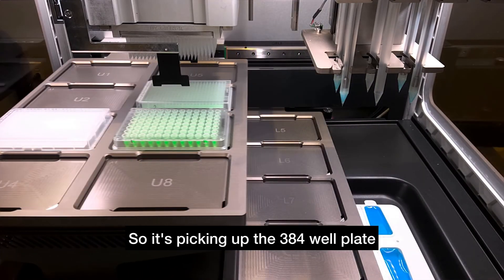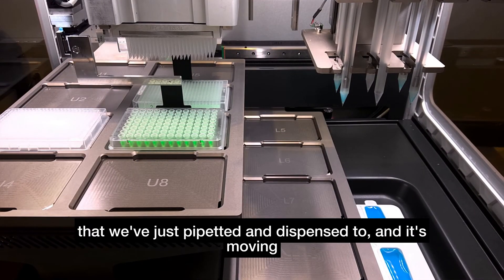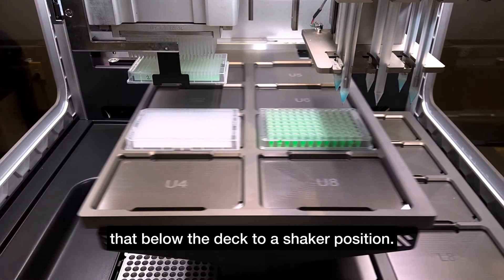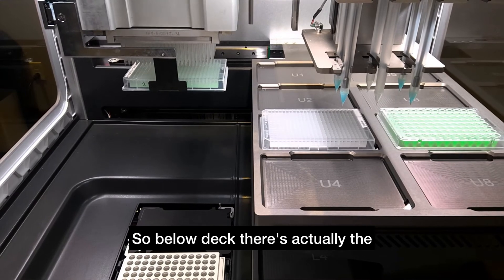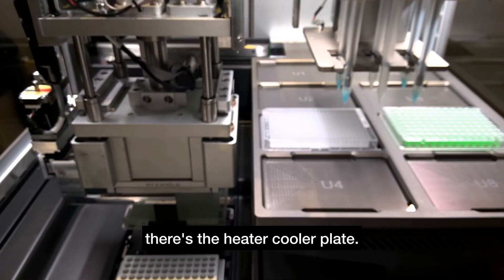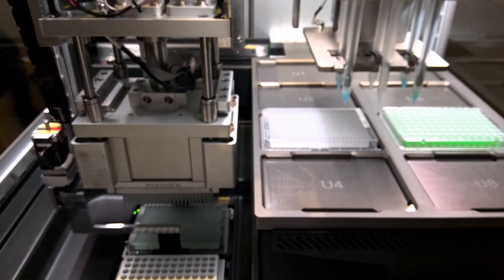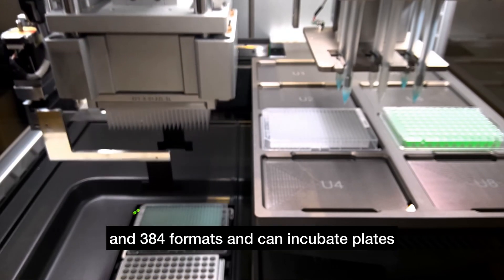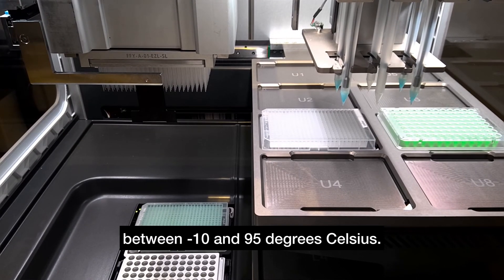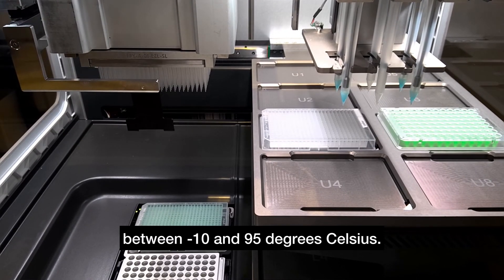It's picking up the 384 well plate that we've just pipetted and dispensed to, and moving that below the deck to a shaker position. Below deck there's the shaker we're moving to now, and just in front of it there's the heater cooler plate. That can work for both 96 and 384 formats and can incubate plates between minus 10 and 95 degrees Celsius.